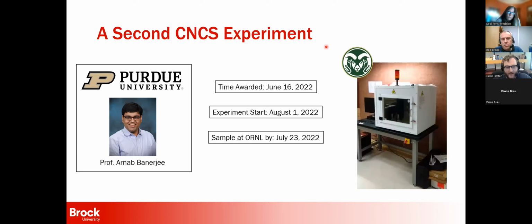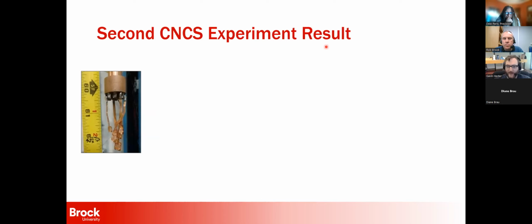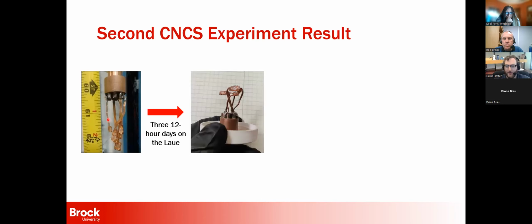And so what we decided was that my advisor would fly me back to the lab I did my PhD in at Colorado State. Luckily, many of the samples were already there, and I would use the Photonic Sciences Laue 1,000 miles away to align my samples. And so this is what I did. I flew out, and over the course of 3 about 12-hour days, I was able to take the sample from the original experiment and reorient it to another scattering plane so that we could apply the field in a different direction in the crystal.